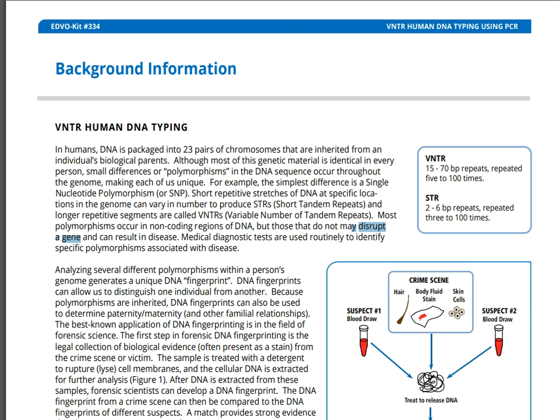So now we can begin this discussion of what we call a DNA fingerprint. A DNA fingerprint starts by looking at these polymorphisms. In whatever form they come, these polymorphisms can be compared from person to person or sample to sample. This is what we're looking at eventually when we get to the electrophoresis. That is really what you've looked at in the electrophoresis gels in the prior DNA experiments we've done, even though they were pre-packaged assembly kits. But this is what we're looking for.